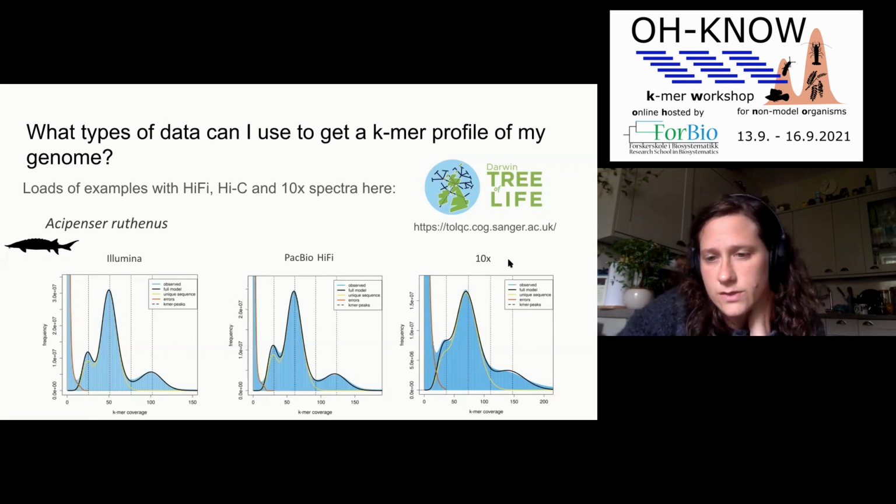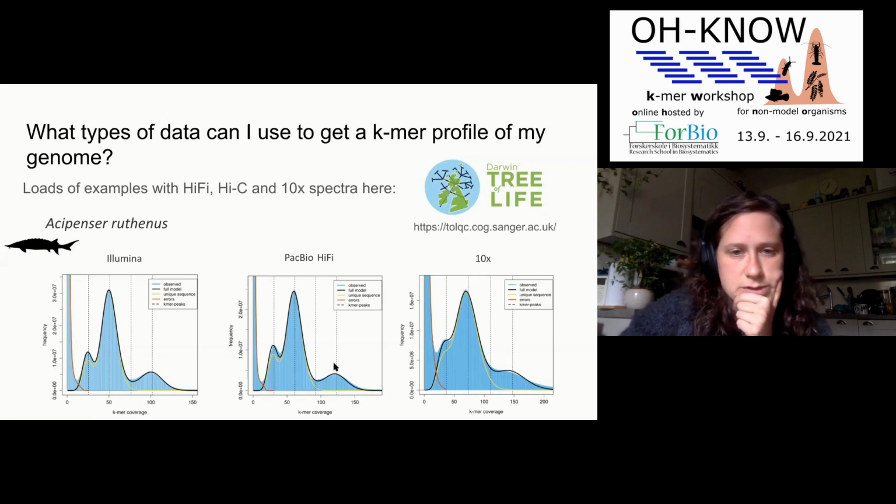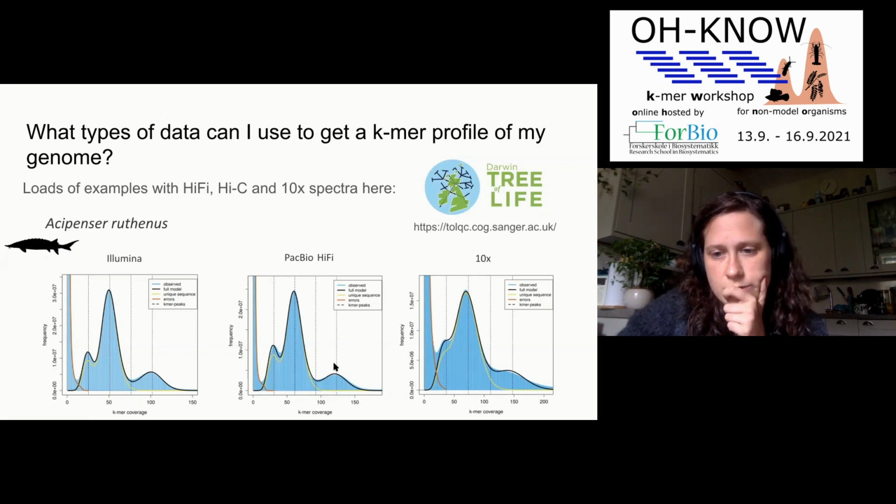And then you can also get your Kmer spectra with 10x, which is slightly different, but it shows more or less the same properties. And of course, you probably need more coverage for that.